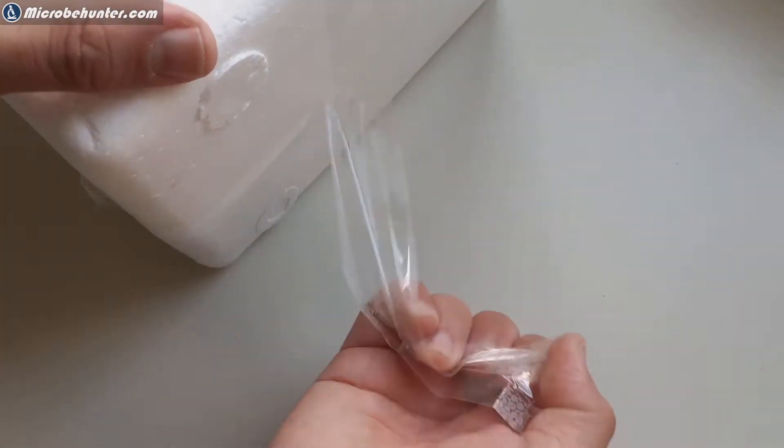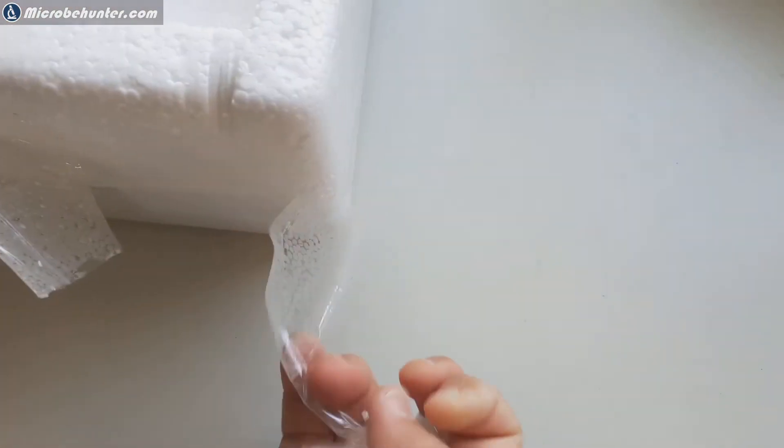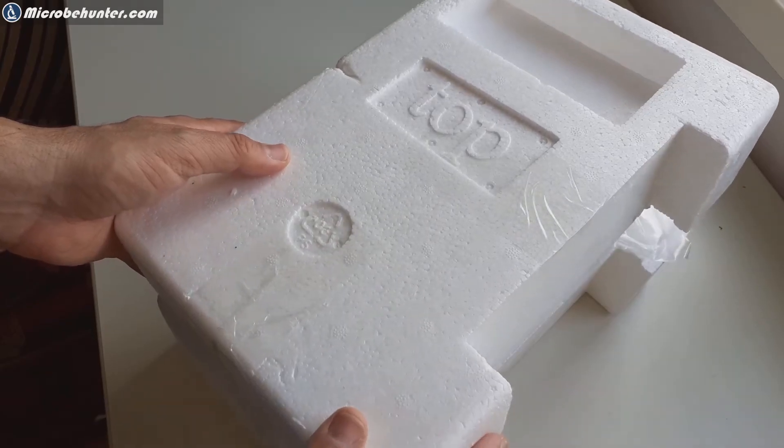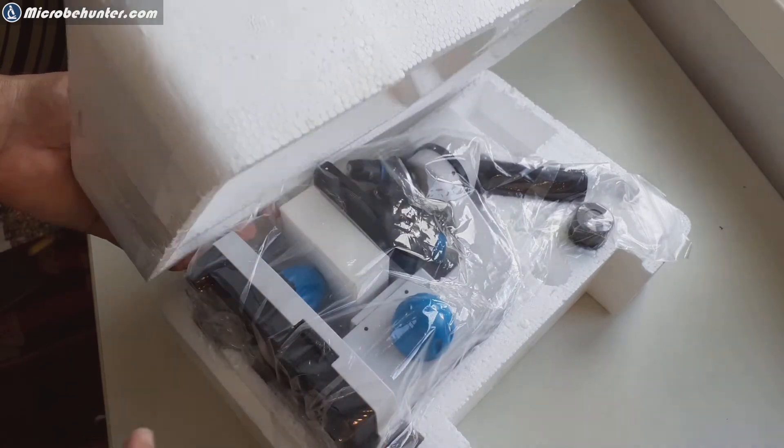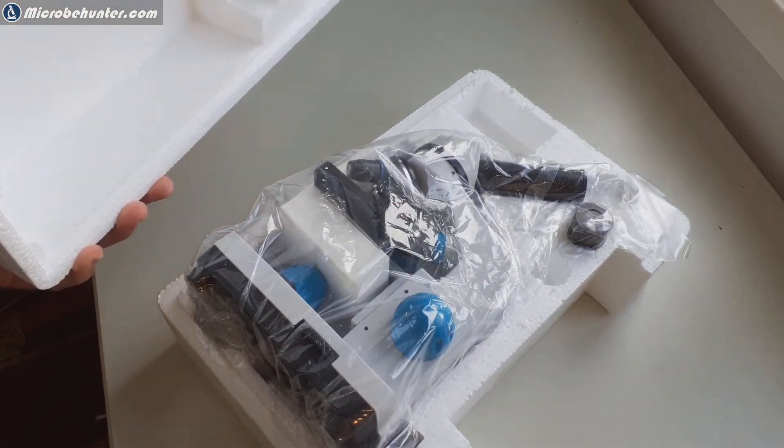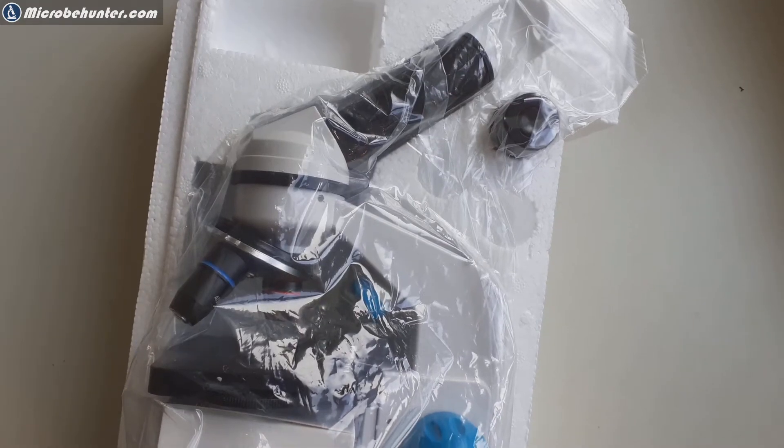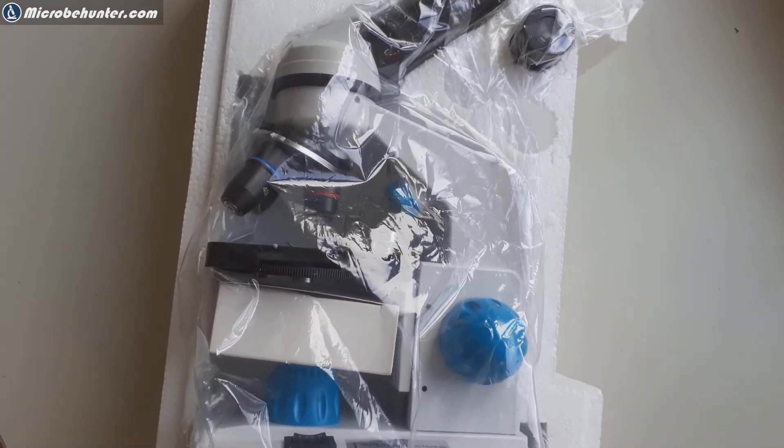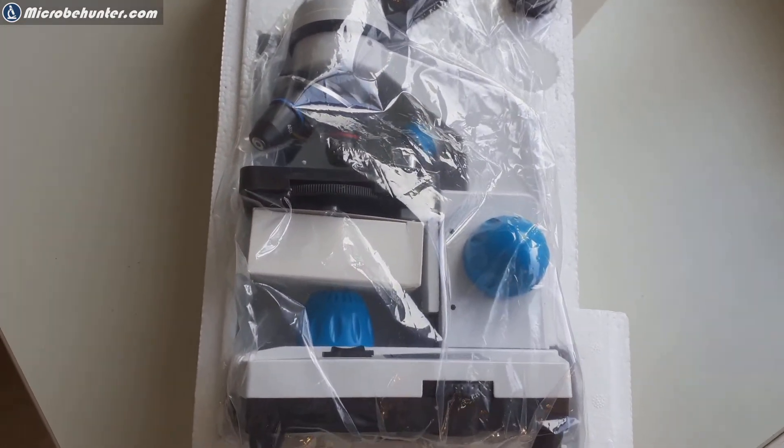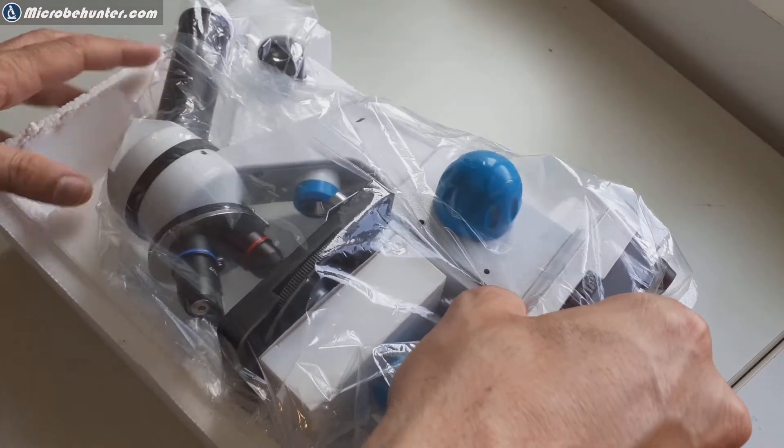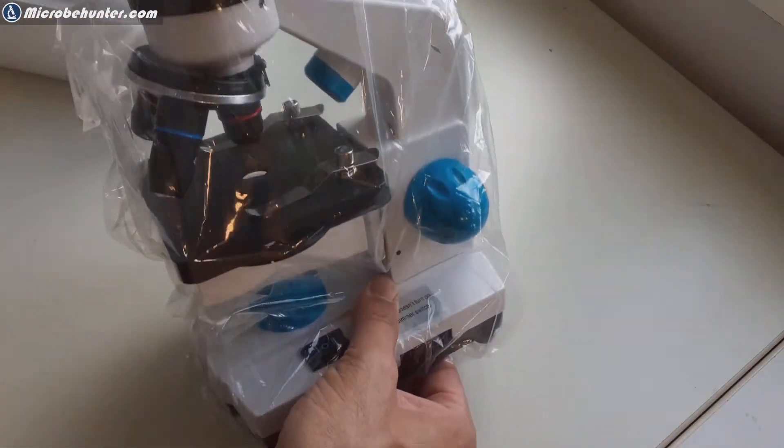So now I wanted to unpack the microscope itself. Of course you have to make sure that the top is on top you don't want to have the parts falling out and here we go here it is. It's nice and compact, can be easily transported of course it's children's microscope and therefore portability is very important and I've seen that there is yet another cardboard box in there so I'm going to have a closer look again.